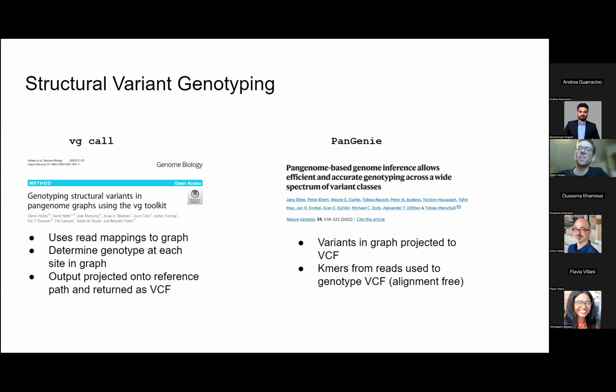And then another thing I'm working on is comparative pangenomics, because Minigraph-Cactus and Progressive Cactus sort of live in the same software package. One aligns genomes of different species. One aligns genomes of the same species. So I'd like to be able to combine those two alignments. So say align the human pangenome to the rest of the primates, et cetera. An interesting ongoing work. Next slide.